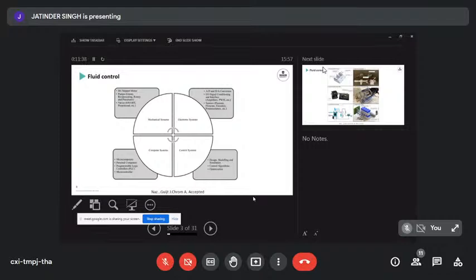That's the algorithm, if-then. The final commands are given by the computing system, which is stupid by itself. So a little bit of understanding of how the electronic part and control works is very useful if you work in a microfluidic system, because quite often you're developing a new system. So you need to build from scratch and think about not only the fact that you need a valve, but also how you're going to be operating your valve.